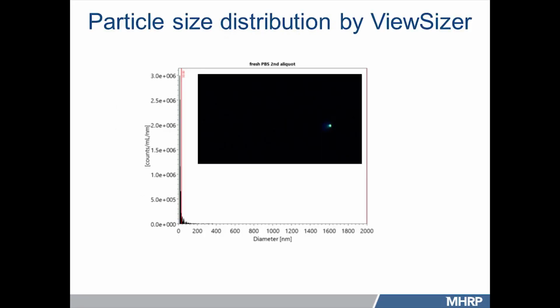So to make the measurement very accurately, we made a blank measurement on the diluent, which is PBS in this case. And as you see here, there are very few particles present, and that's what you want for your application because you do not want too many particles in there because they will spoil your measurement. In fact, we have a cutoff of 30 nanometer size, so any particle less than that is excluded as impurity. It could be some bubble which we see in there. The same thresholding was applied later on.